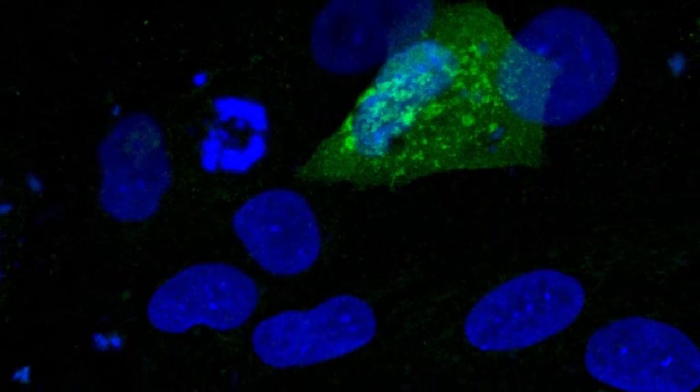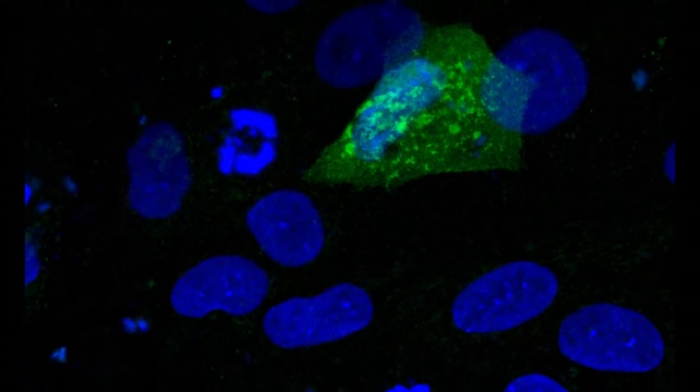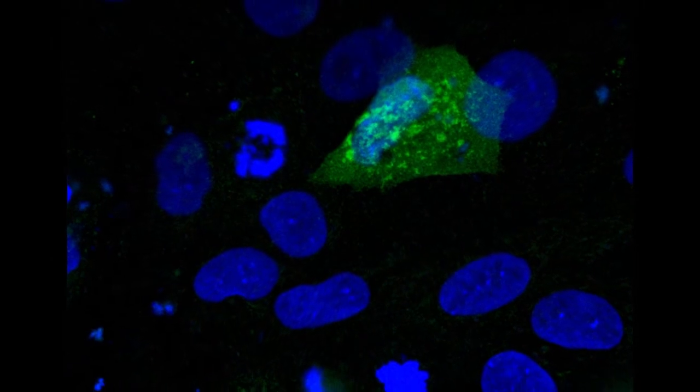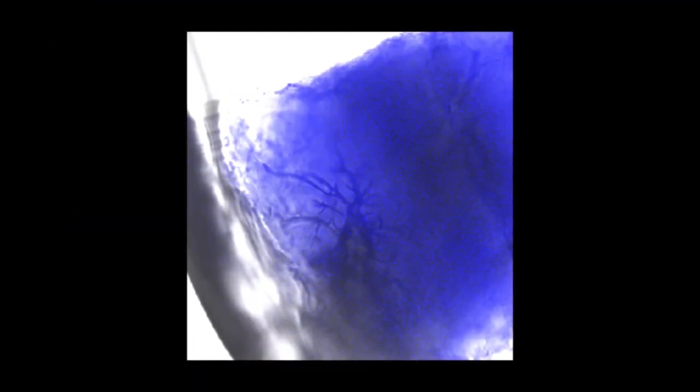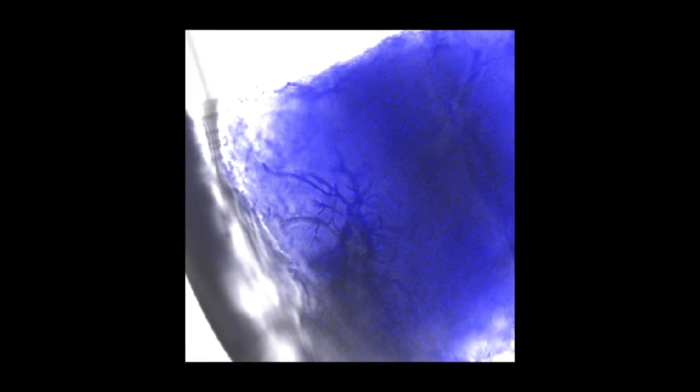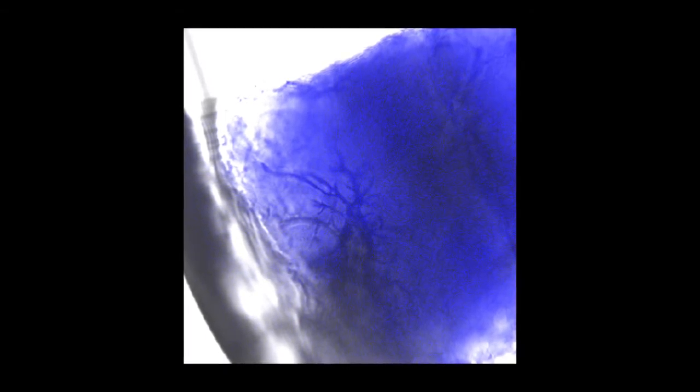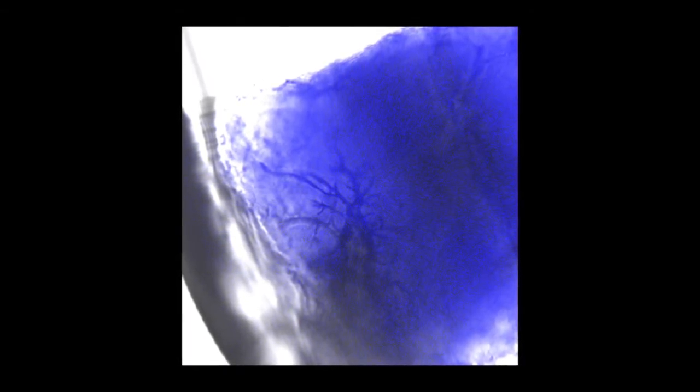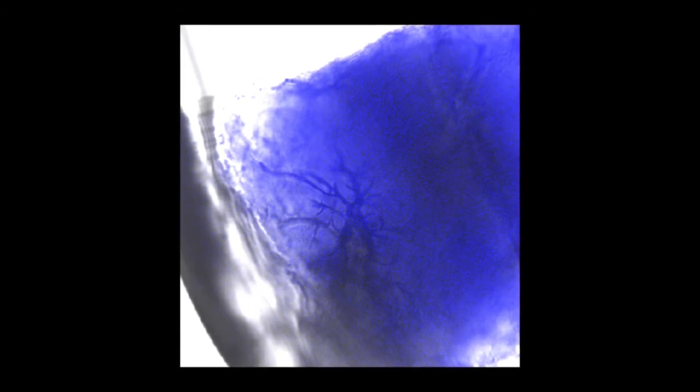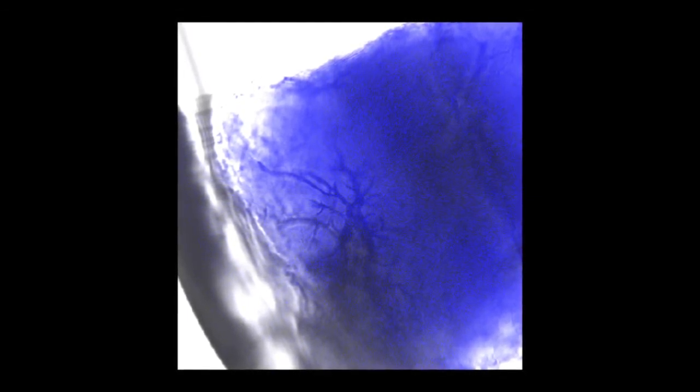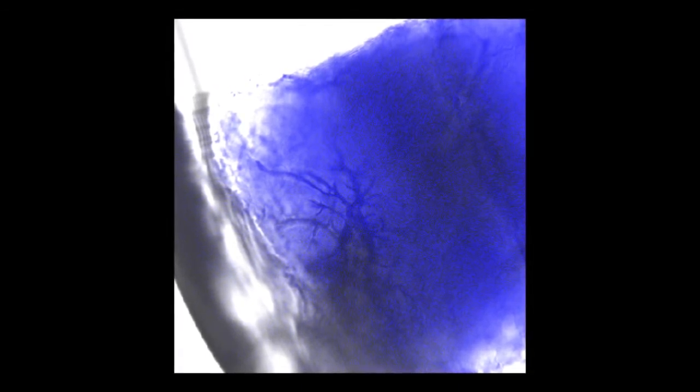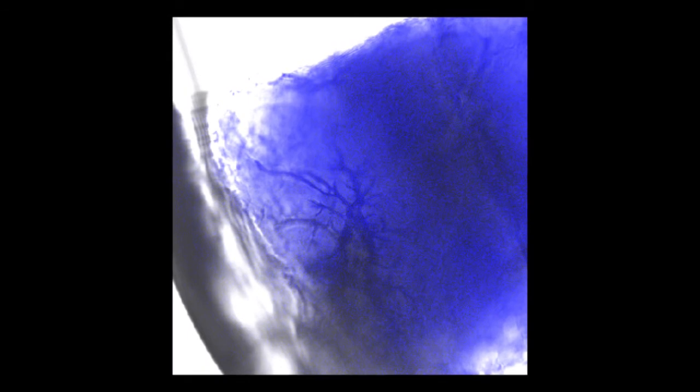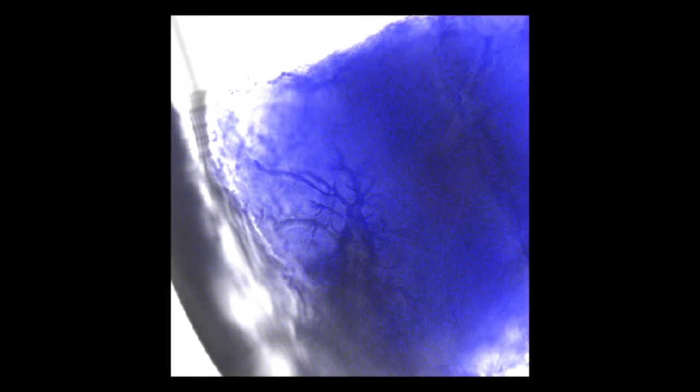And then here's some more chick embryo cells. Very pretty. Here's a slide I took myself. The material that led to the image is of a triceratops horn bone recovered from the Hell's Creek formation. It was processed through a decalcification series yielding soft tissues with exceptionally well-preserved osteoblasts.